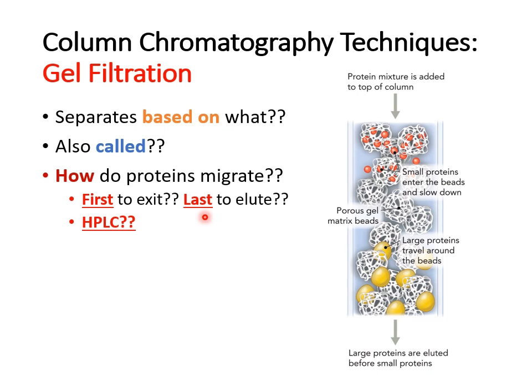Now, sometimes for gel filtration chromatography, you will also see the term HPLC. That is a high resolution version of basically this gravity-based gel filtration chromatography that will have a column matrix with extra small beads in it, much smaller pores and matrix within it, and high pressure, that's what the HP is for. High pressure will be used to force the buffer and the proteins through the column.